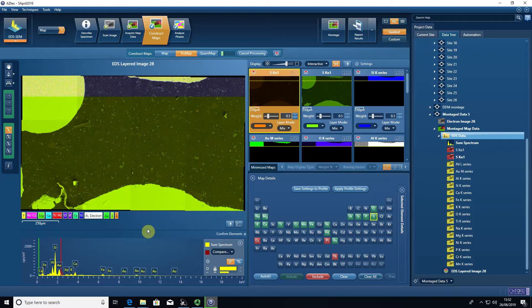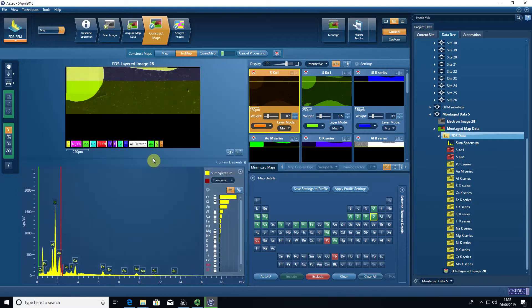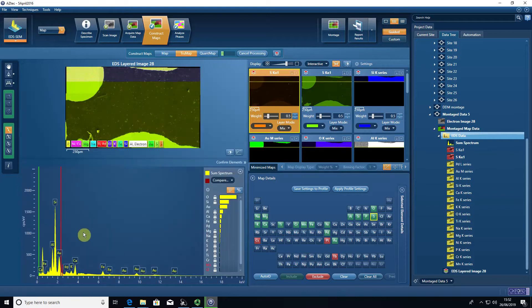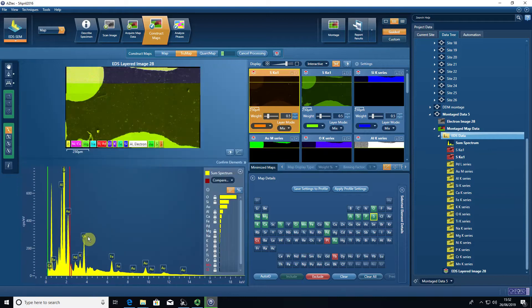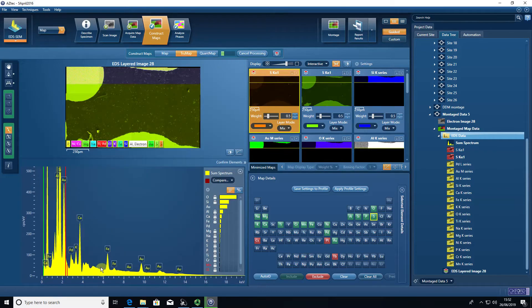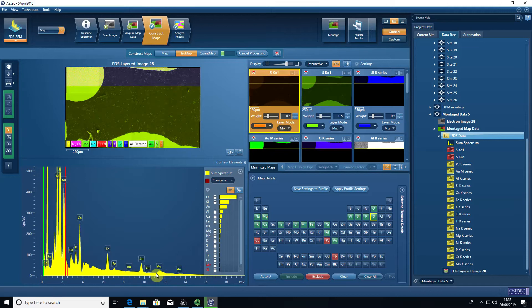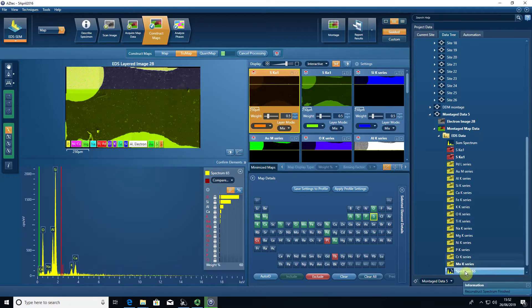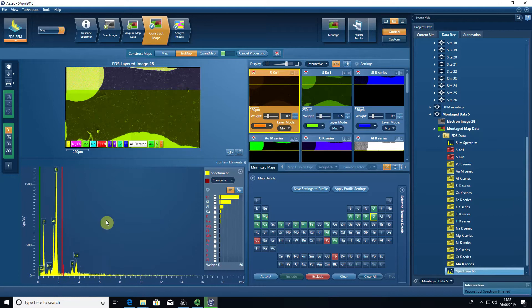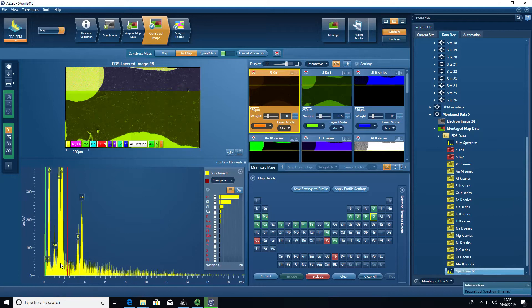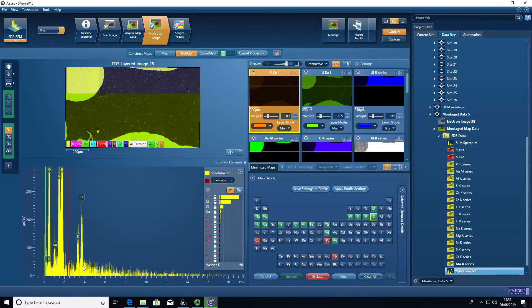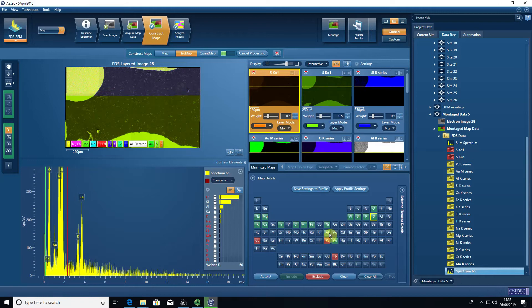What's actually happening when you press true map is that the software is modeling the background of the spectrum of each pixel. It's modeling this background, subtracting it from the peaks, and then it's also dealing with any overlaps that exist from the elements that we selected.